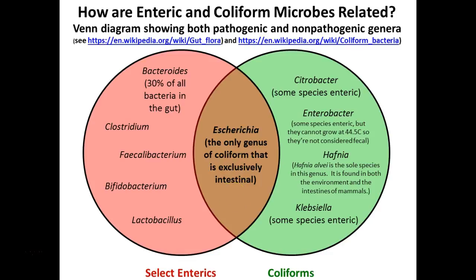And that's also why I prefer to use the EMB plates as opposed to the MacConkey. What does E. coli look like on these plates, y'all? That metallic green sheen, right? It's very distinctive on these plates.